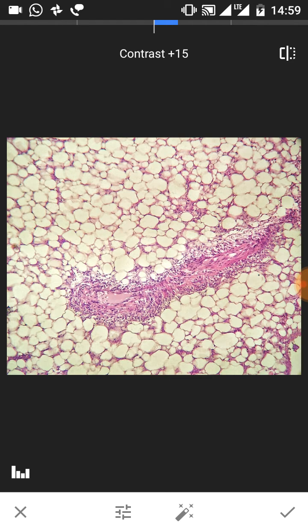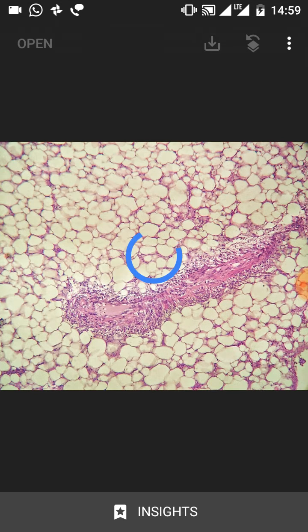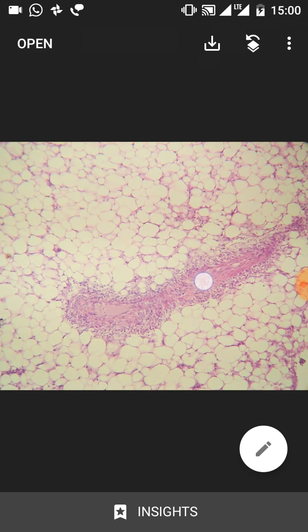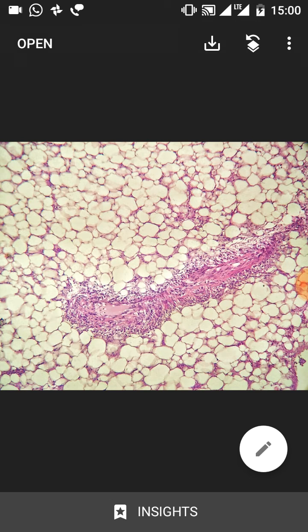Now you can click on the bottom right arrow to save all these changes that you have made. If you long press on the screen and compare it to the original unedited image versus the image you have now, you can see a vast difference in the two images.